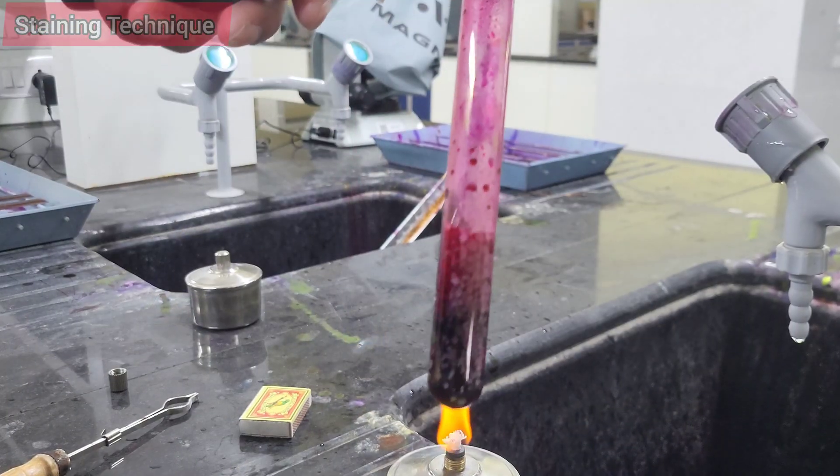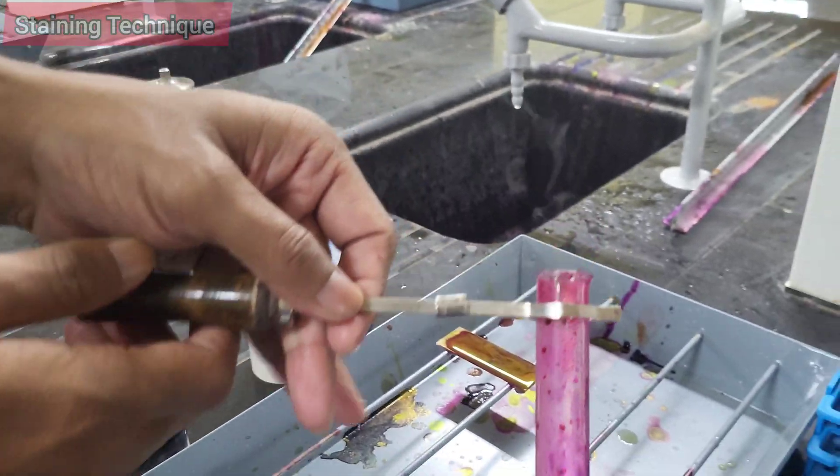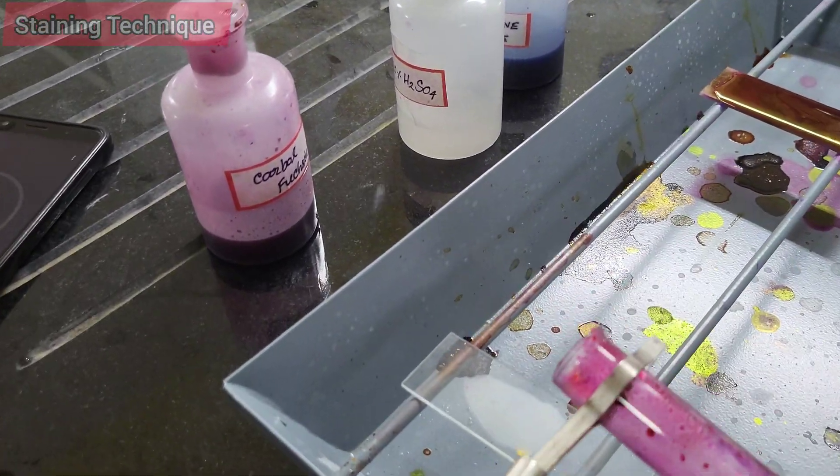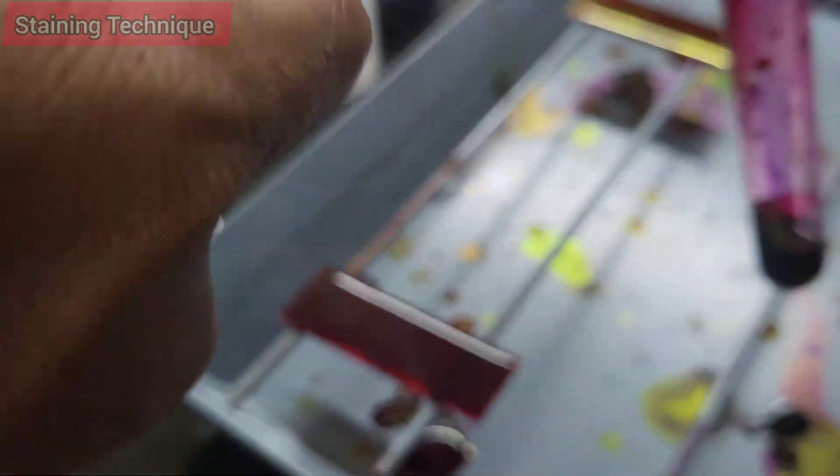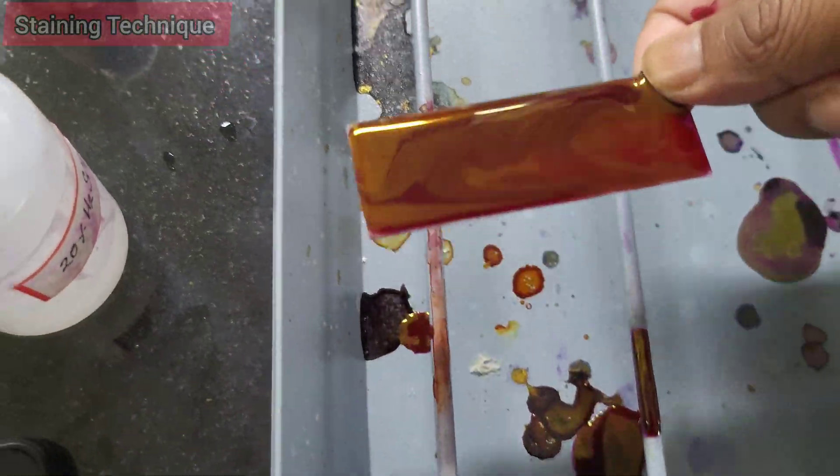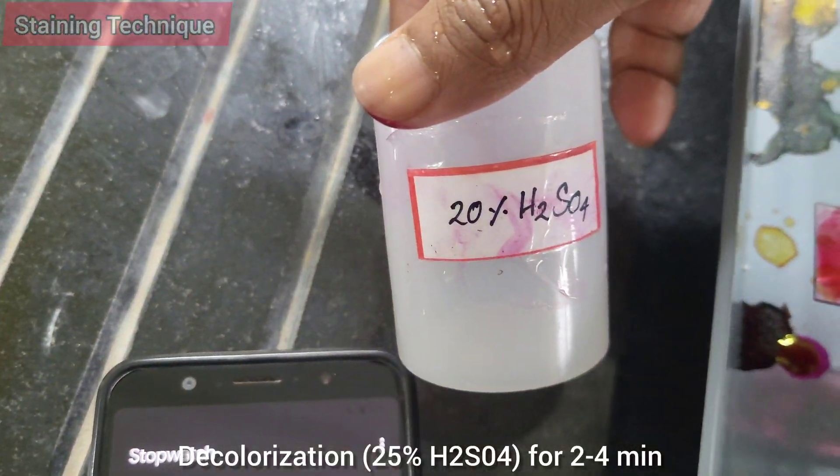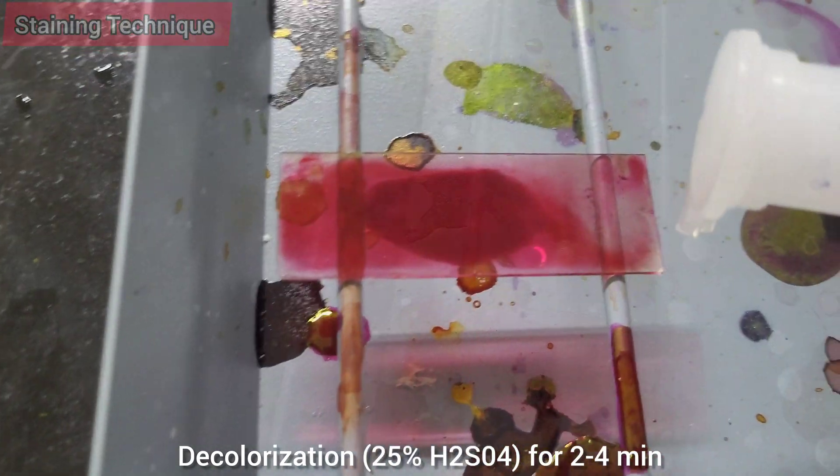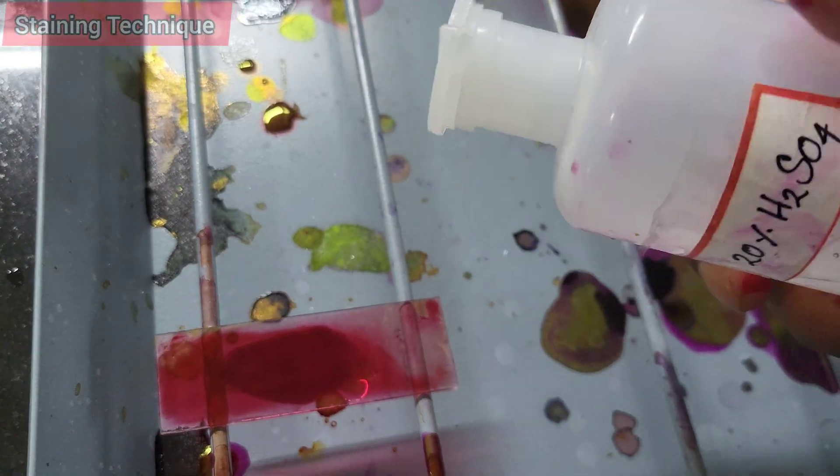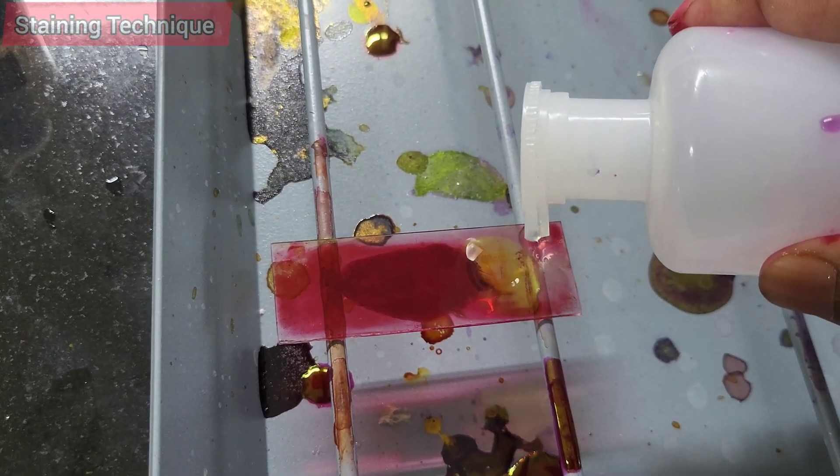What is the composition of carbolfuchsin? Basic fuchsin, phenol, ethanol, and distilled water. After five minutes, rinse the slide gently with tap water to remove excess stain. Step two: decolorization, done by pouring 25% sulfuric acid over the slide and allow the slide to stand for two to five minutes. A properly decolorized slide will appear colorless or light pink.